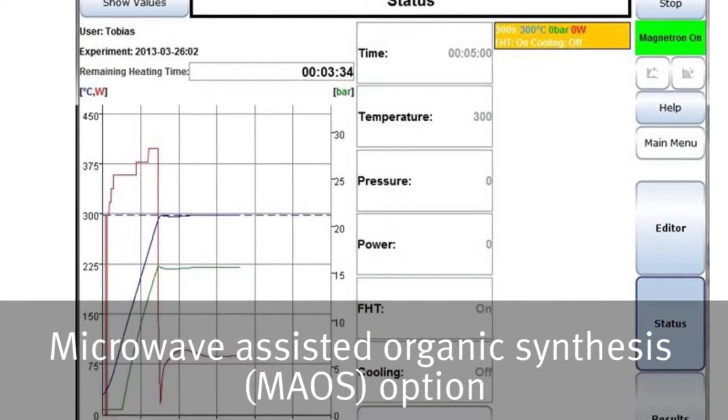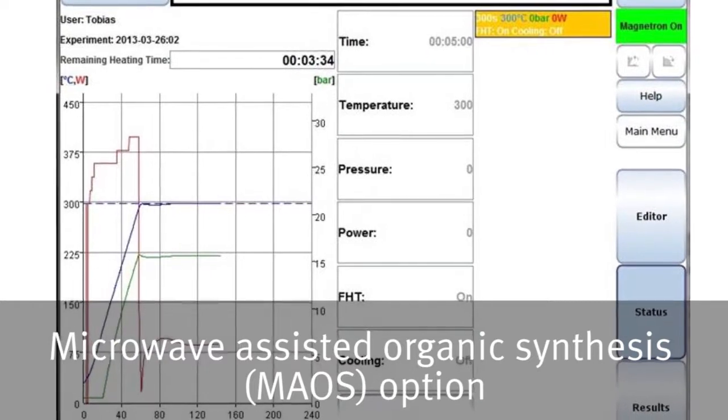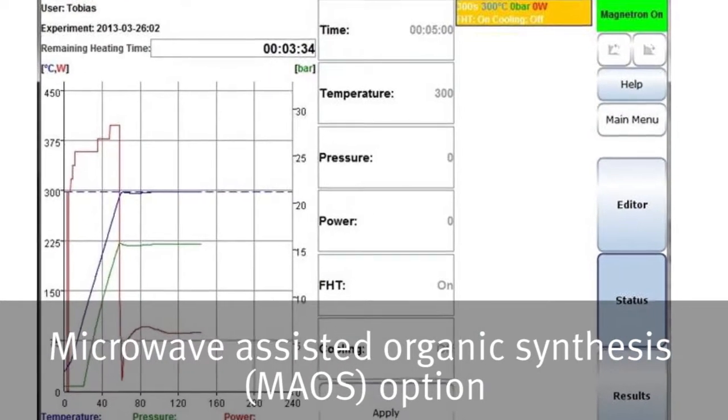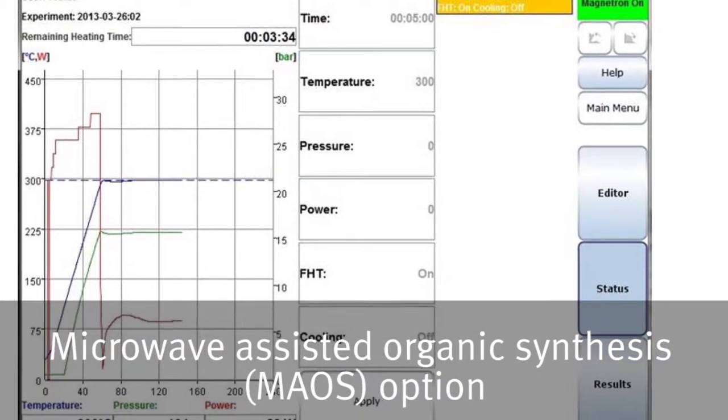Use the optional organic synthesis kit to easily reconfigure an Alstra system to allow organic synthesis at higher temperatures and pressures.